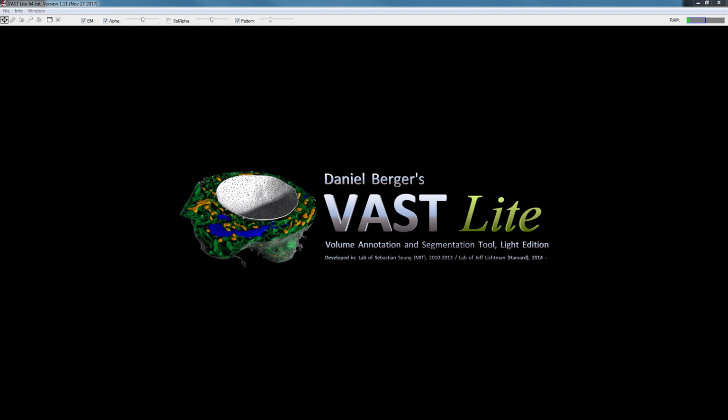Hello and welcome to another tutorial video for Vast Lite. In this video I will explain how you can import your own image stack into Vast.